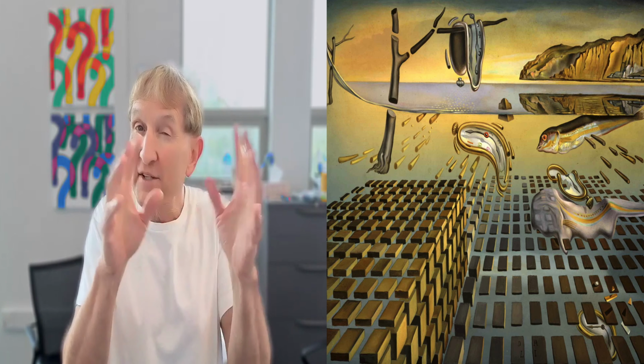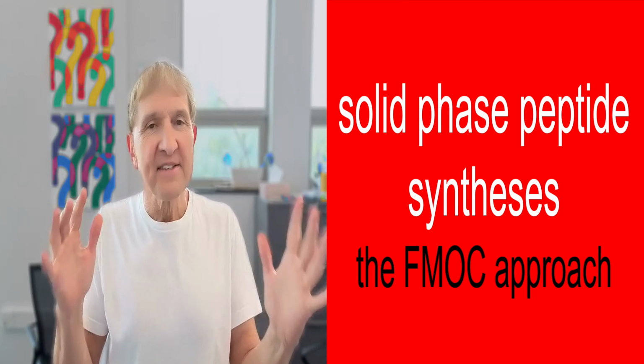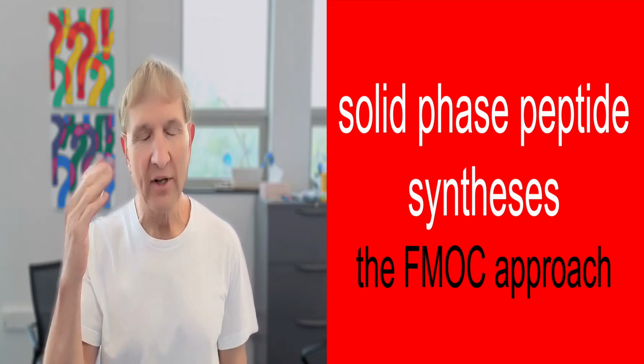In a multi-step synthesis, one step after another, the time-consuming part is purification of each intermediate. Mixing up the reagents for a reaction doesn't take much time. Waiting for the reaction, usually not much time. But purifying your product from the excess reagents takes a long time. Solid phase synthesis is a huge time saver if it can be worked out so every step is very efficient.